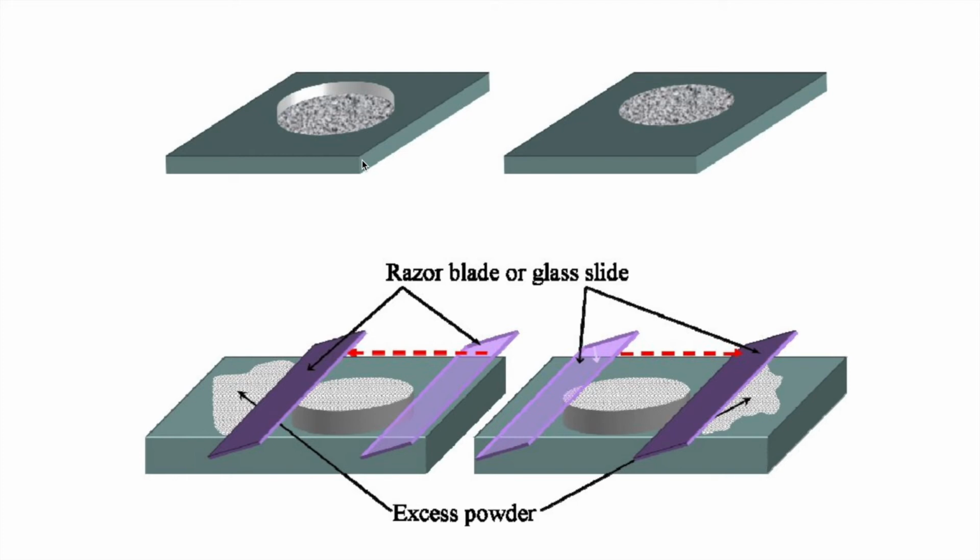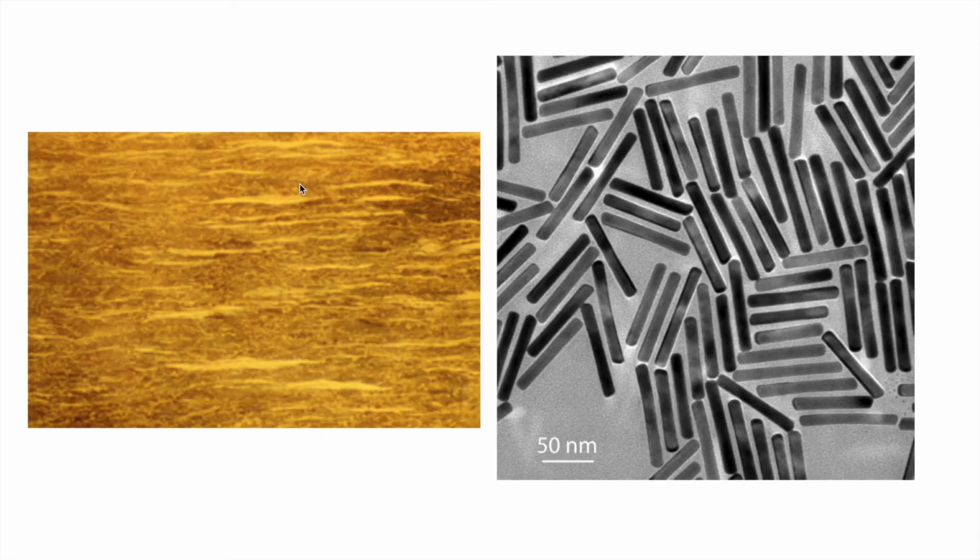The larger these crystals are, the less random it becomes, and the more likely we're going to have something like this, where there's only the diffracting planes that are parallel to the surface, right? So that's always going to limit what we see in those cases.